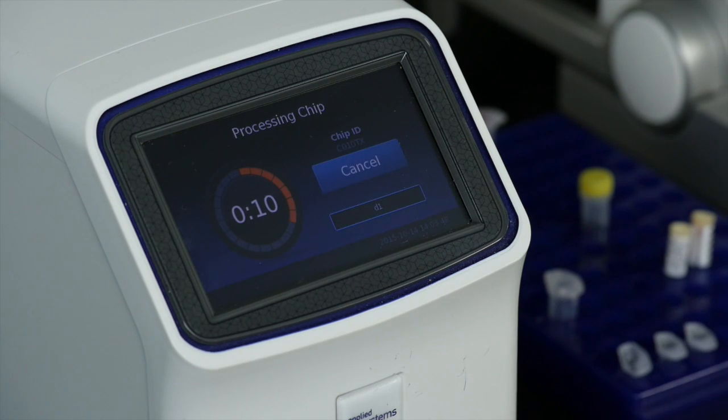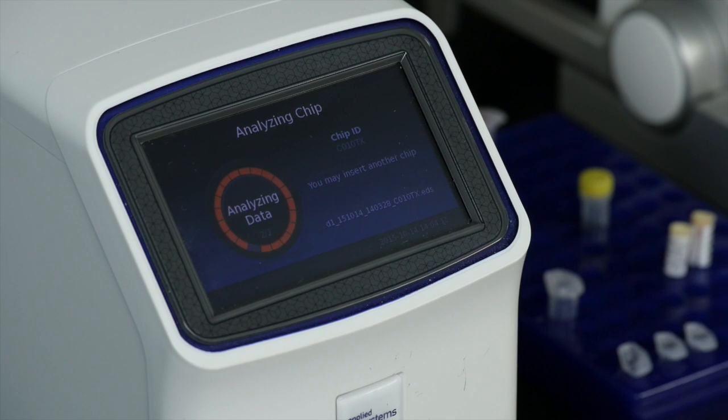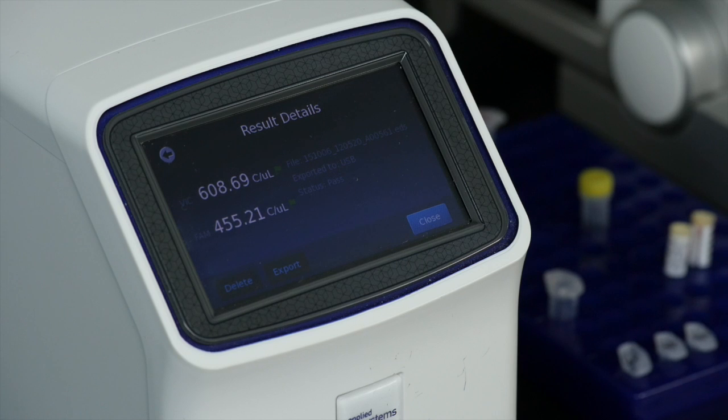During the chip reading process, the instrument reads the unique chip identifier and captures the fluorescent signal from the amplified sample. A chip read consists of capturing ROX, FAM, and VIC images for all reaction wells. Data output is count of copies per microliter for both FAM and VIC channels.